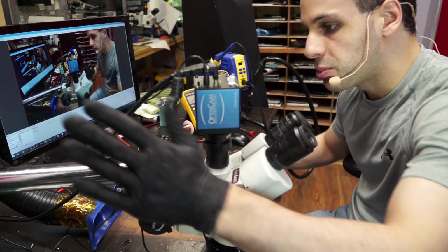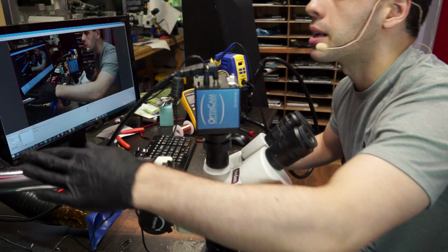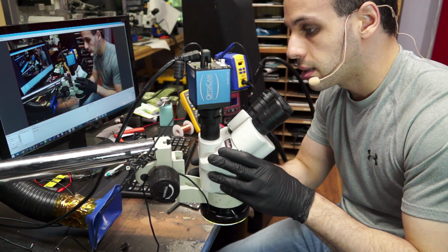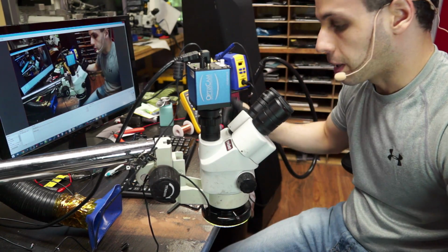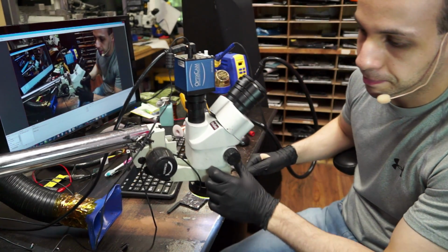So the reason my preference is the boom stand is I can make the boom stand more flexible, but I cannot make the articulating stand more sturdy. So that's why I like this thing.